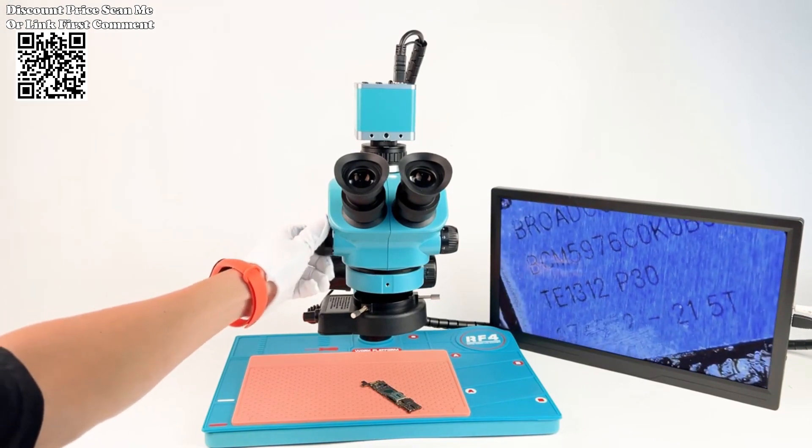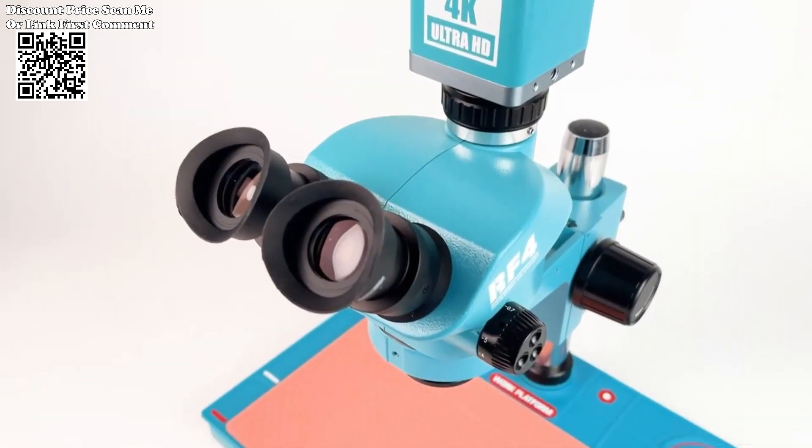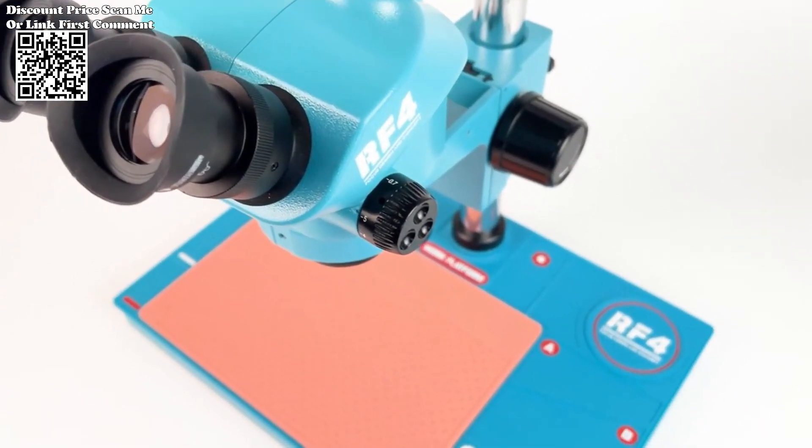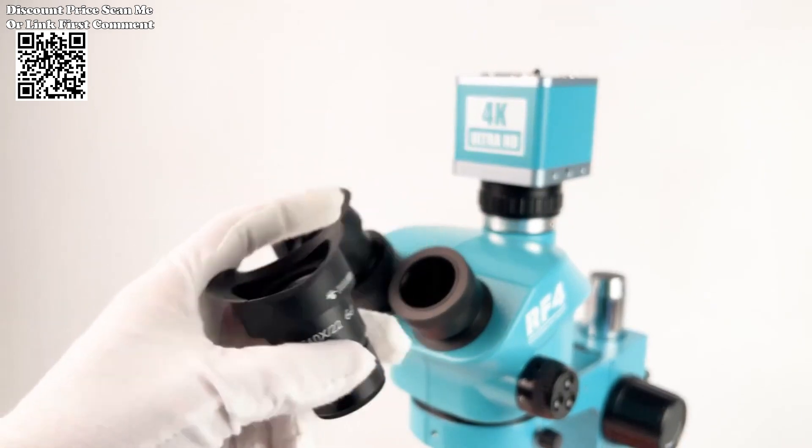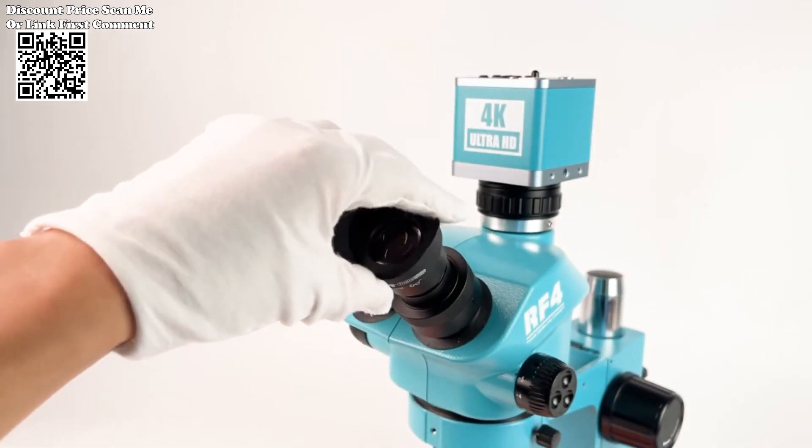Optical clarity and precision: experience the brilliance of sharp, distortion-free imaging. The RF4 microscope ensures that every detail is rendered with utmost clarity and precision, allowing you to uncover hidden intricacies and anomalies with confidence.